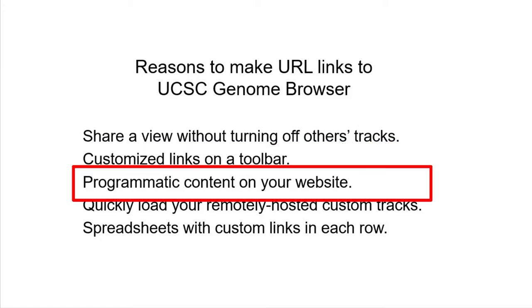You may be developing a website which generates information about locations, genes, or other annotations. Your software can generate a link to the browser on the fly that shows exactly what you wish to show.